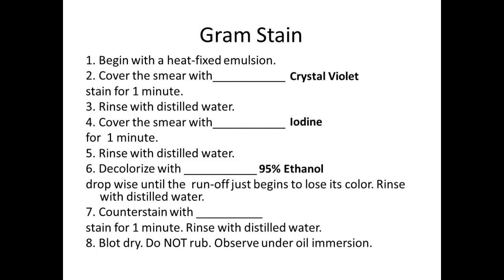For the gram negatives, they have peptidoglycan, but not enough to trap it in. And then they also have another layer that gets removed by the ethanol or seriously damaged. What layer is that? The outer membrane, right? So at that point, the gram negatives are colorless, right? So in order to stain them, you must counterstain them with safranin.